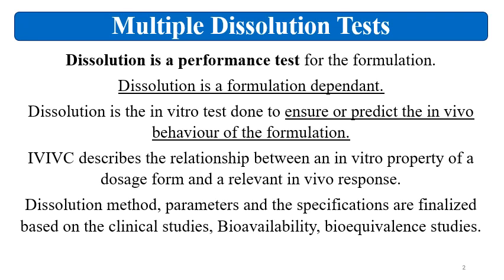So you have made a formulation with some criteria for the bioavailability or the bioequivalence. Now the dissolution will be very specific for this type of formulation, and based on the clinical studies and IVIVC if available, the specifications will be finalized.